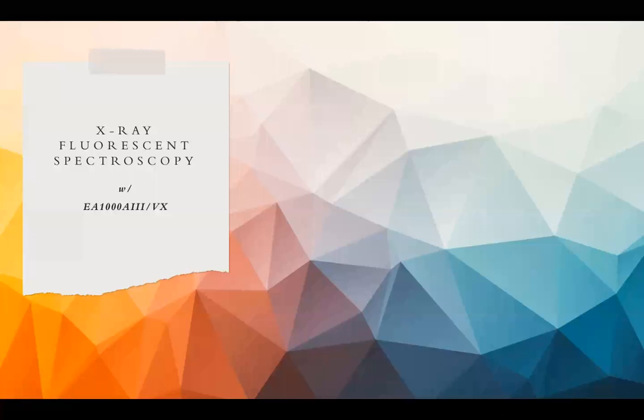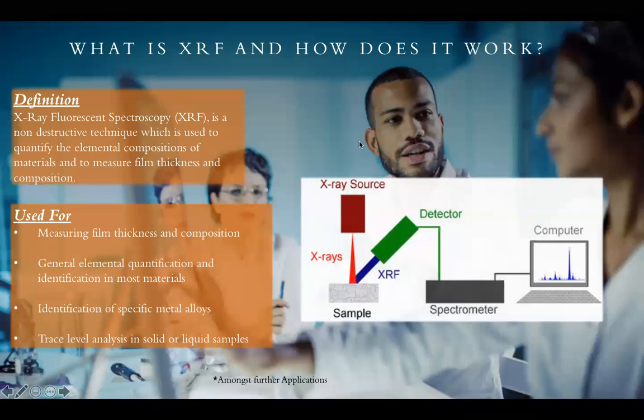Hello, my name is Moses Washington, and today I'll be talking about X-ray fluorescent spectroscopy using the EA1000A3 as well as the EA1000VX, as they have similar specs. What is XRF and how does it work exactly?